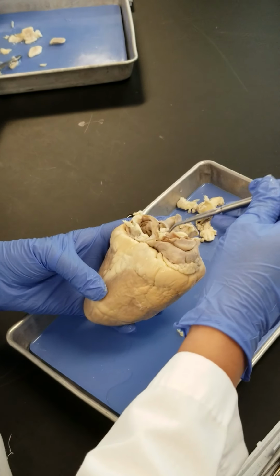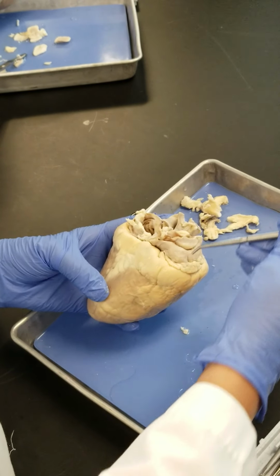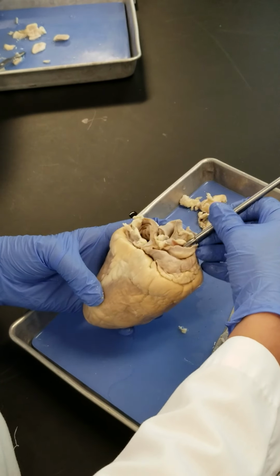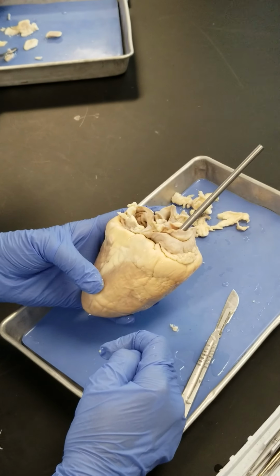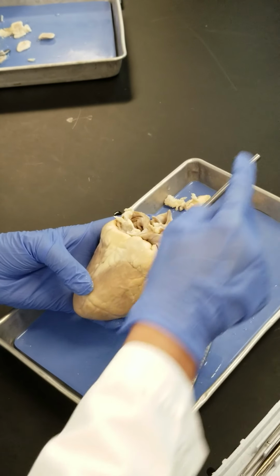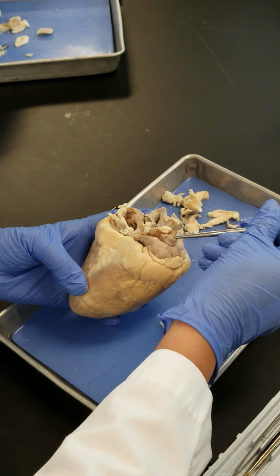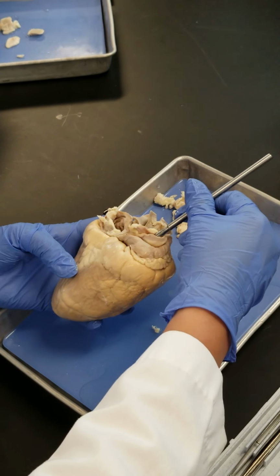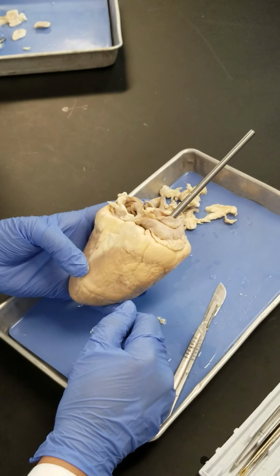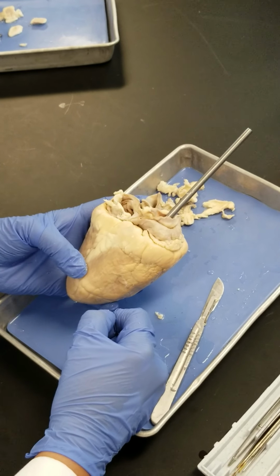They bring the blood from the whole system of the body, right? So this is the direction that the superior vena cava is getting into the right atrium from here, right? So this is the opening of the superior vena cava here. The rest of it has been cut here, but this is the opening of the superior vena cava. Now search and see if you can find the inferior vena cava.